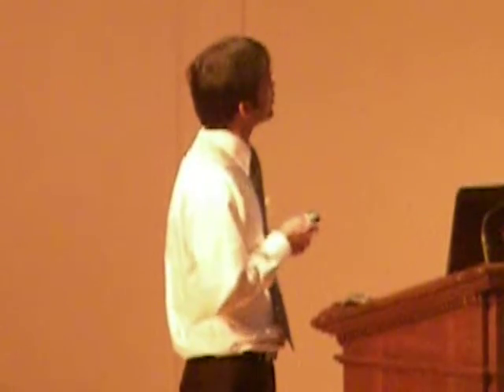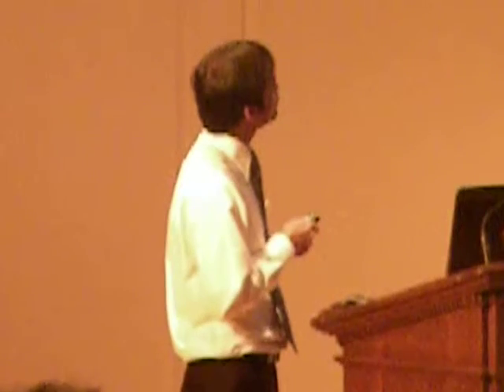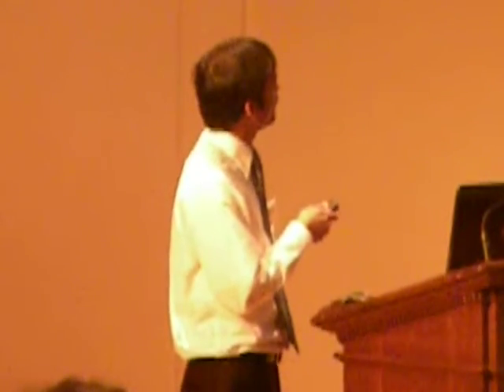These are the five scattering curves from the different concentrations. Maybe it is not quite obvious to see the depression and the bump at the arrow shown here. Can you see the depression and bump? Maybe not. Anyway, I can make it clear later on.